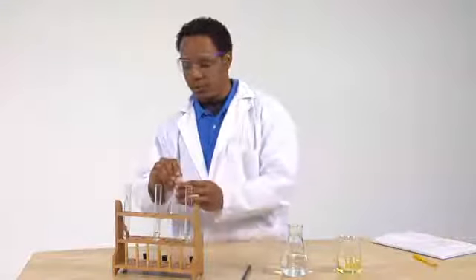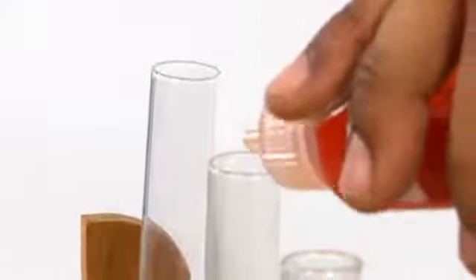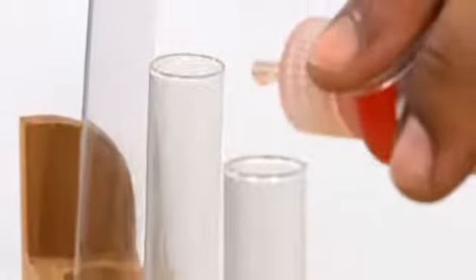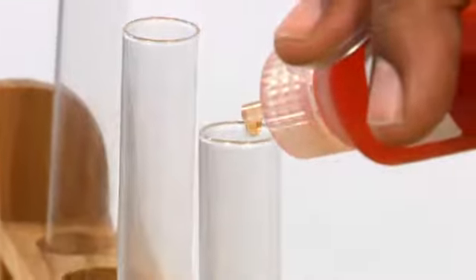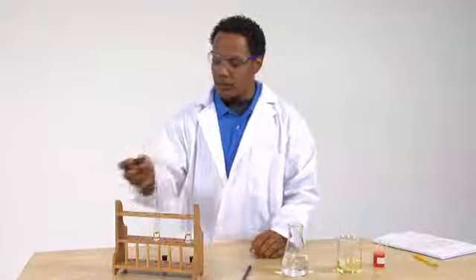Now I'll add 3 drops of Sudan 3 to each test tube. I'll shake each test tube well and allow them to settle.